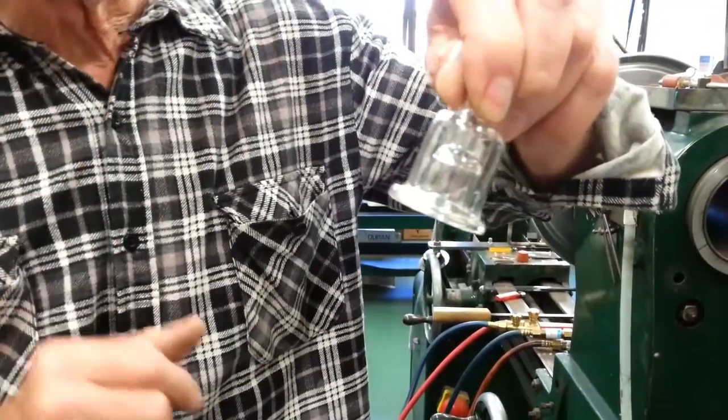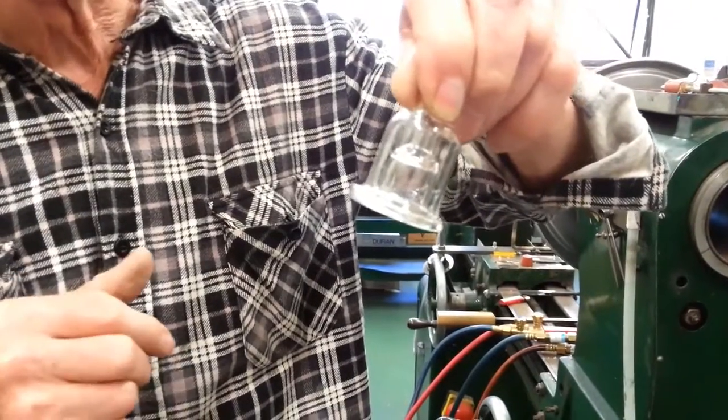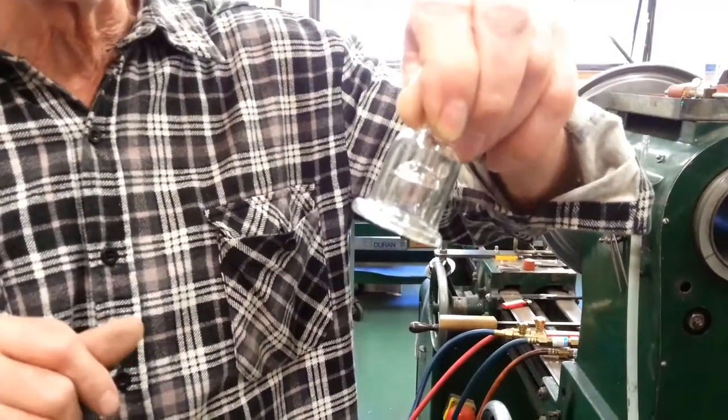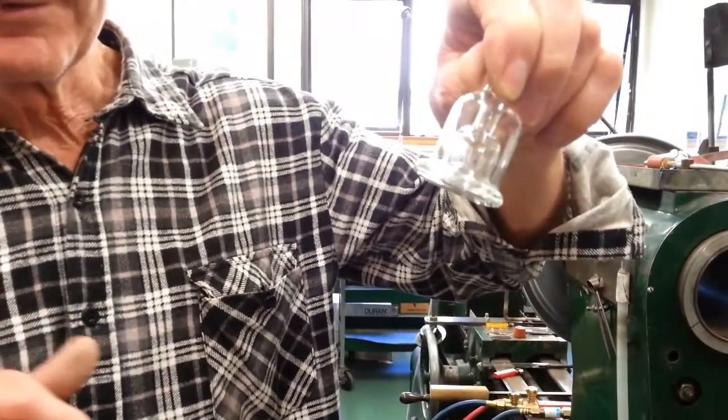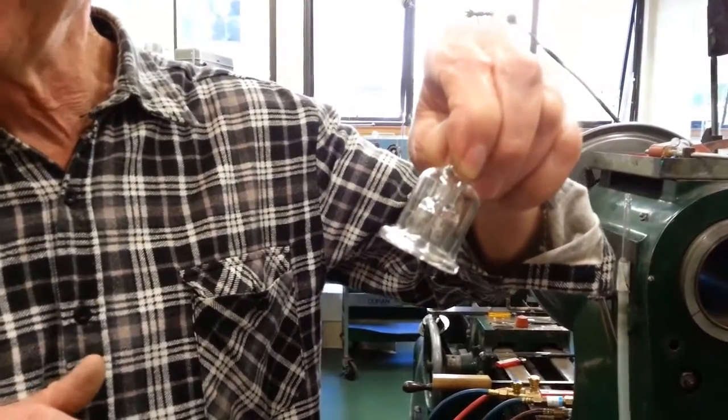So there's blood in here. Parafilm across here. The mosquitoes are feeding on the blood, which has got certain chemicals in it and antibodies and all sorts of things, so they can play around trying to defeat malaria. So you get quite a variety of work. It's quite nice coming to work and getting nasty.